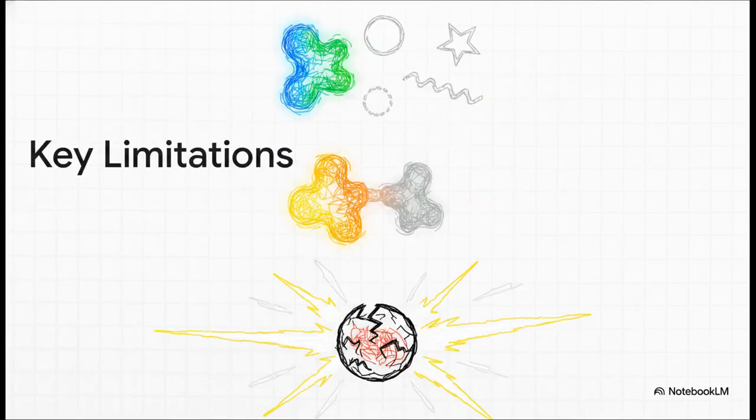However, we do have to be objective about the physical limitations here. First off, you only see what you successfully tag. Everything else in that microscopic environment is entirely invisible to you. Second is a pretty frustrating issue called photobleaching. Over time, that constant excitation causes the reactive dyes to permanently lose their emission intensity. The glow literally fades into darkness. And finally, there's the phototoxic effect. Blasting living cells with high-energy photons can actually harm or, unfortunately, even kill the very microscopic life we are trying so hard to study.